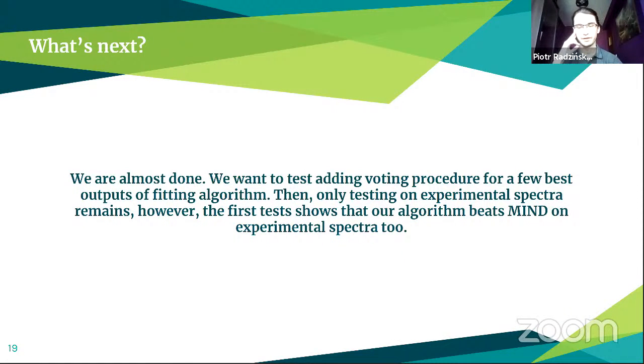So far, the first test shows that even on experimental spectra, we are better than MIND. We also want to test adding a voting procedure to have even fewer of these -1 and +1 errors that can occur during the spectrum fitting.